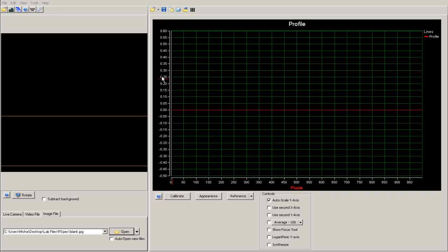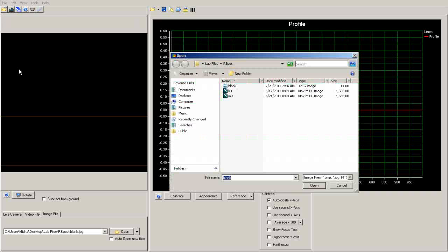The window on the left displays the image, while the window on the right displays the spectrum. An open button can be found above each window. Click the open button above the image window.